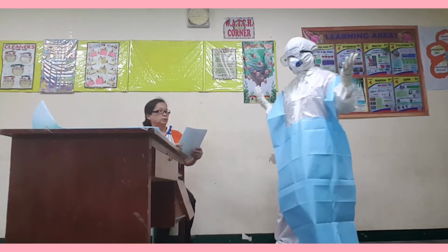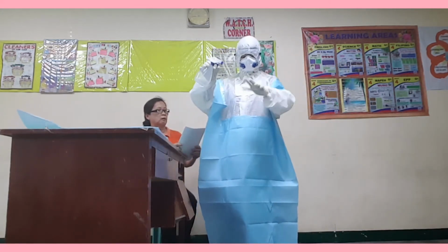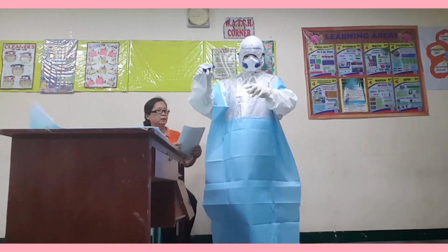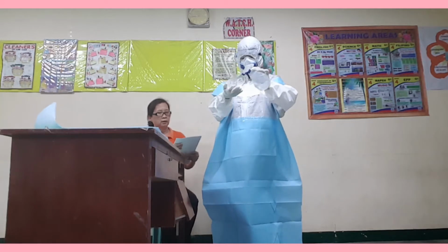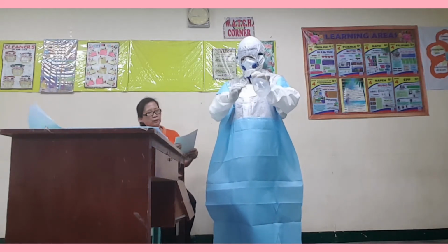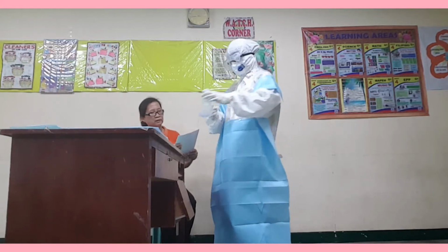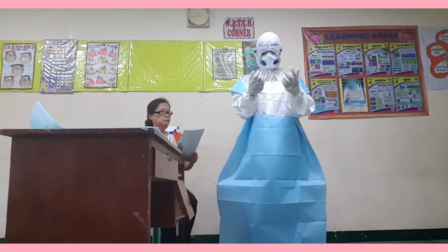Procedure number 2, disinfect outer gloves. Use 1:10 bleach disinfectant or alcohol-based hand rub, ABHR, to eliminate pathogenic microorganisms and to sanitize before disposing.